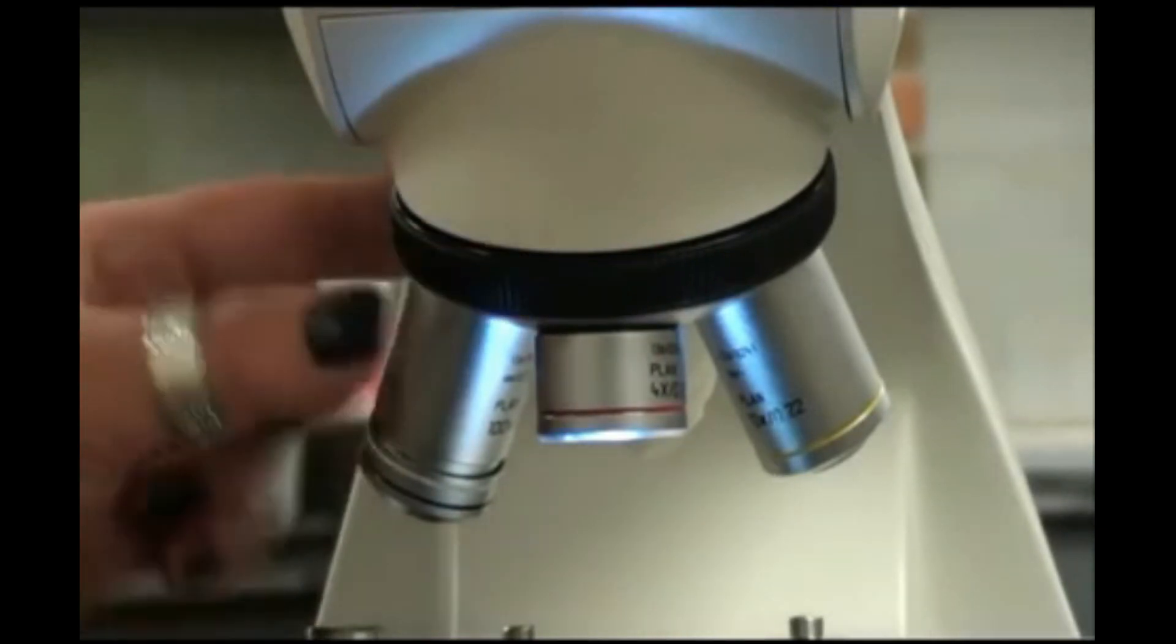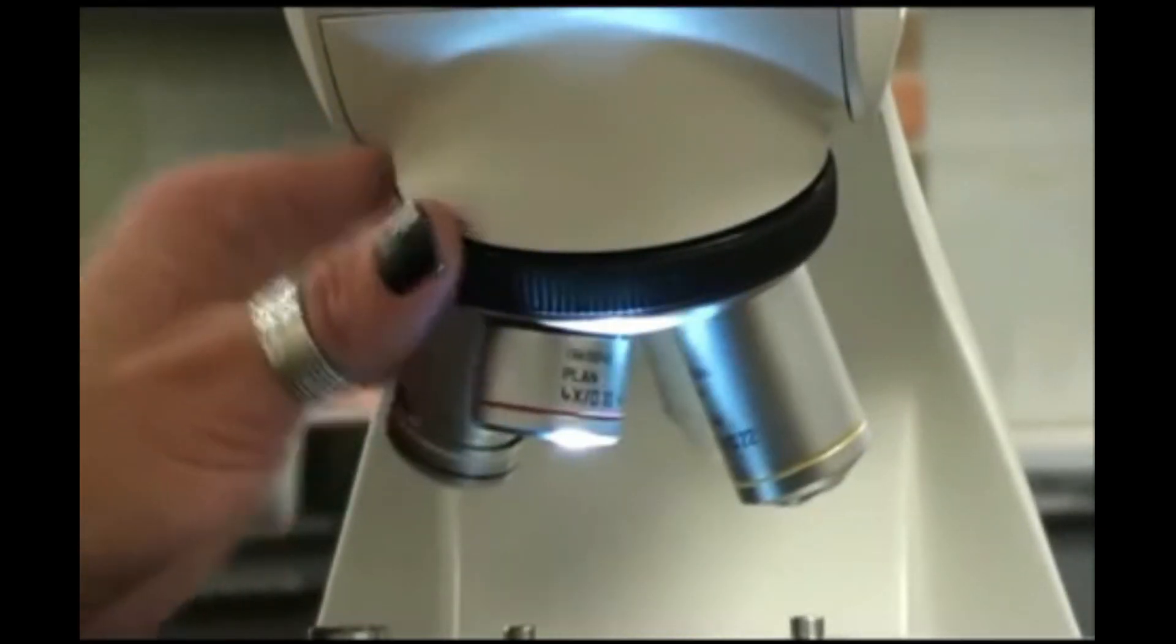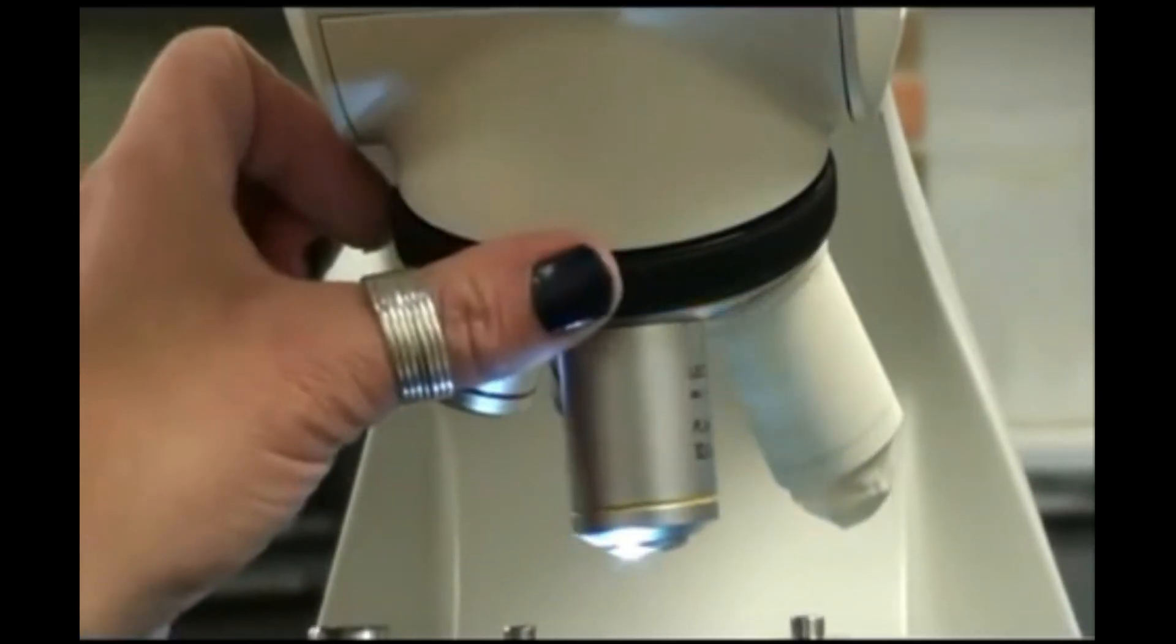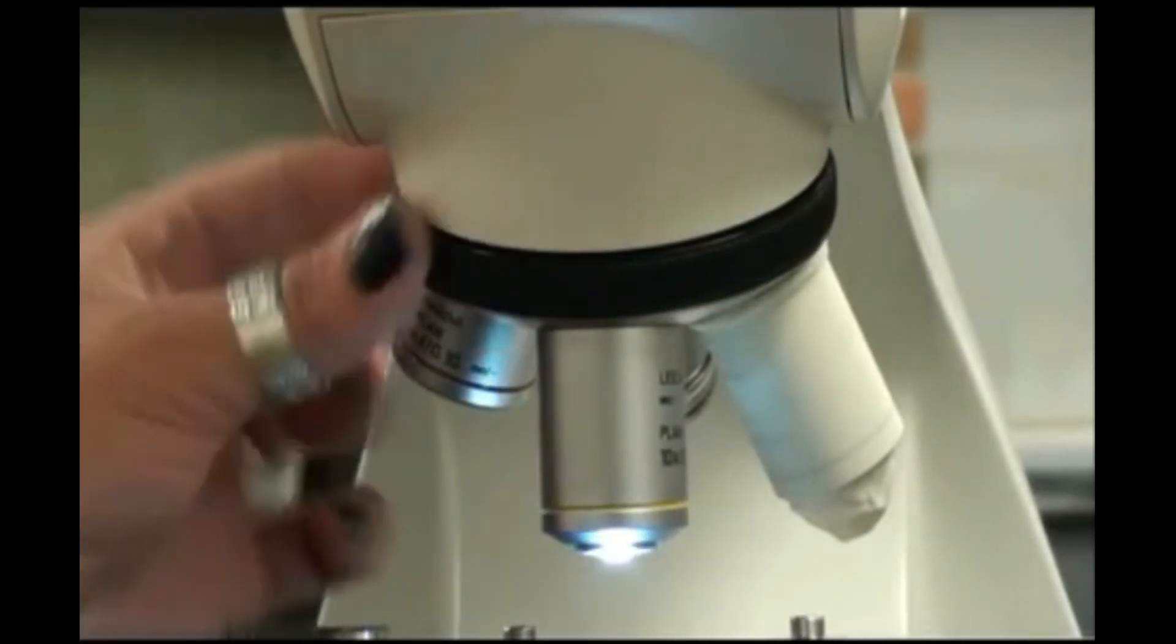The objective lenses are located on a rotating nose piece. Each lens hangs down from this nose piece and can be turned and clicked into position.